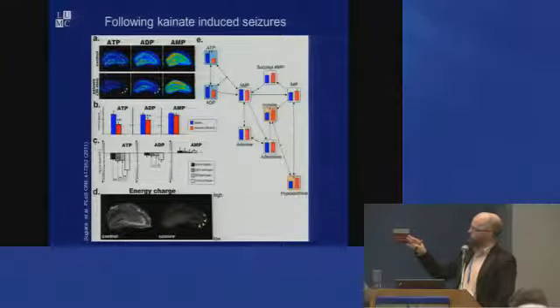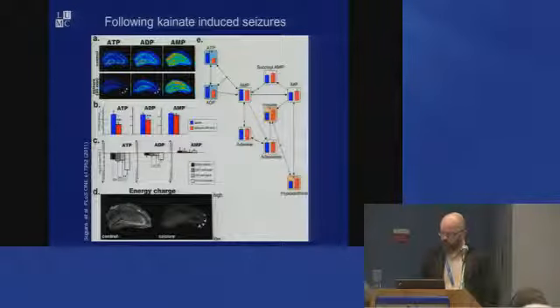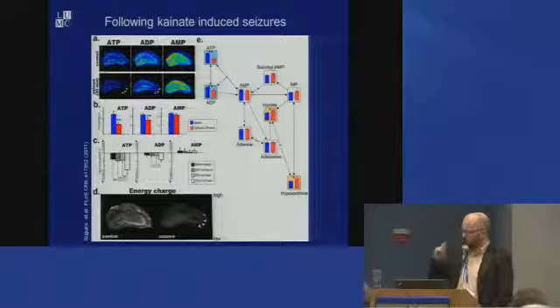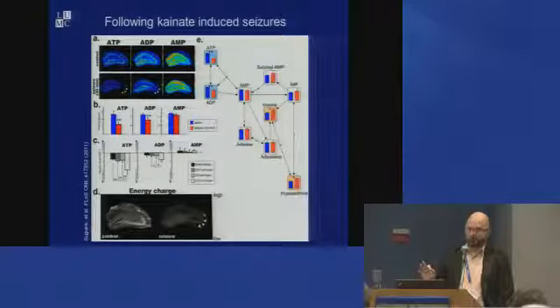One of the reasons this application of imaging mass spectrometry of metabolites is being driven by a couple of Japanese groups is to do with post-mortem degradation. Metabolites change quickly. This group in Japan uses focused microwave irradiation to sacrifice the animal at time zero and deactivate all enzymes.